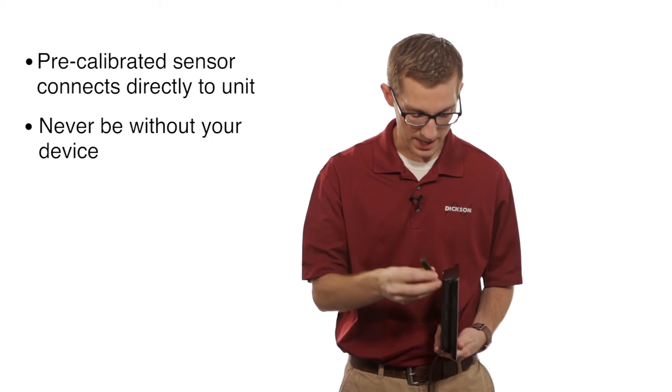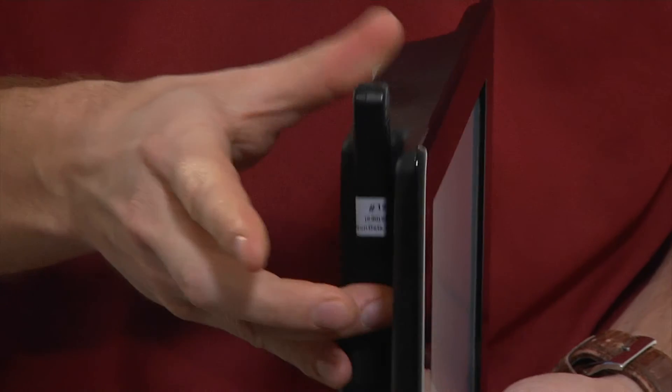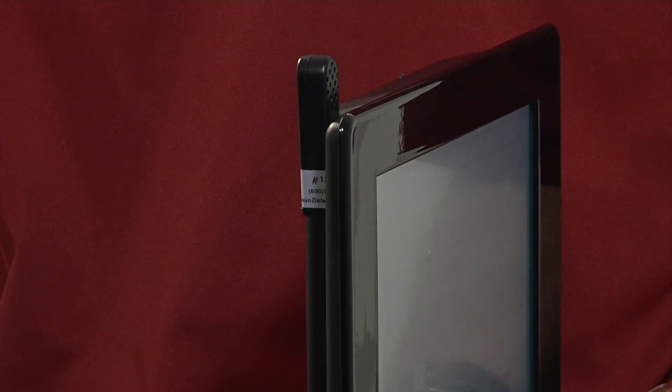When the new one comes in the mail, you just plug it back into the unit right here, and the unit is calibrated for another 6 to 12 months.